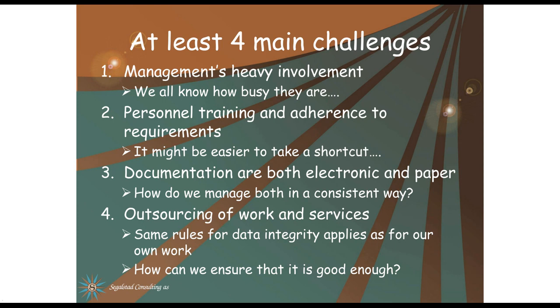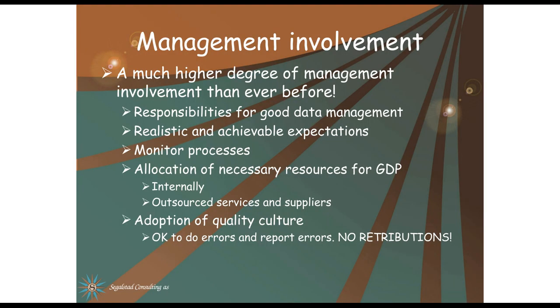As far as I can see, there are 4 main challenges. 1, management needs to be heavily involved, and we all know how busy they are. Personnel training and adherence to requirements, well, it might be easier to take a shortcut. Documentations are both electronic and on paper, and how do we manage both in a consistent way? Outsourcing of work and services. The same rules for data integrity applies as for our own work. And how can we ensure that that is good enough? Well, more details follow.